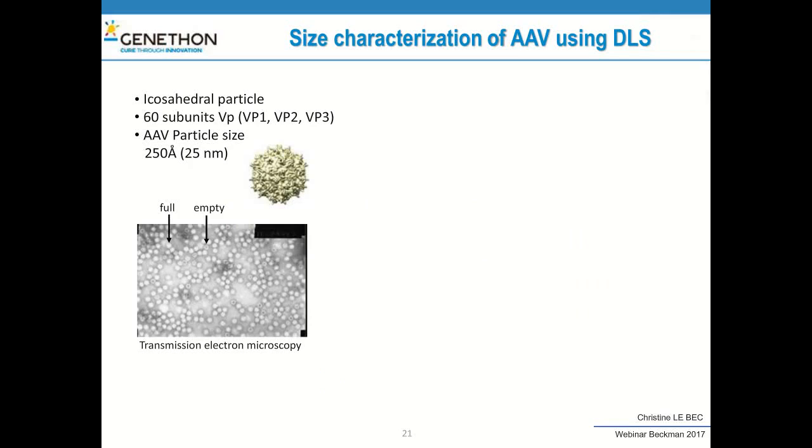Previously, I told you that the motion and the boundary motion will depend on the shape of your product and on the molecular weight of the product. For that, we also control that we do not have any difference in shape between the full and empty particles. First of all, we do microscopy analysis just to see we do not have any difference.